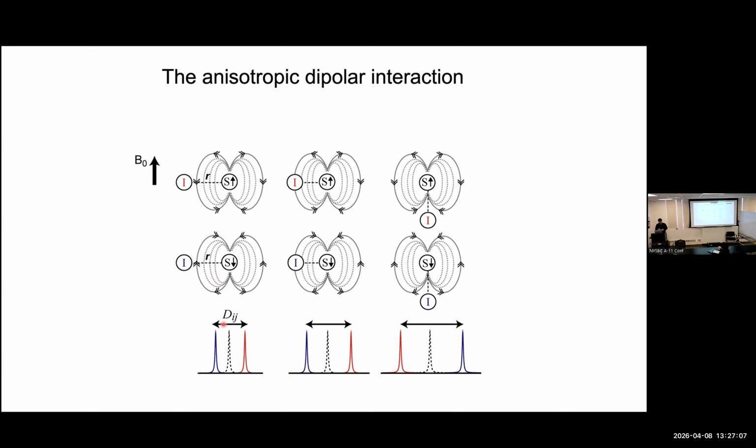Those two states have a difference in their frequencies, and the magnitude of that splitting shown here is the dipole coupling. Now, remember here, I'm freezing my sample, hypothetically, in this 90-degree angle. And if I were to collect, imaginary, let's say, the energies of the states, I would get the splitting, which is the dipole coupling. Now, if I bring my nucleus closer, or shorten the bond length, I get closer to the magnetic flux. The density of the magnetic field from a magnet increases as you get closer. And so that explains the R to the power 3 dependence. That's literally describing the magnetic field's behavior.